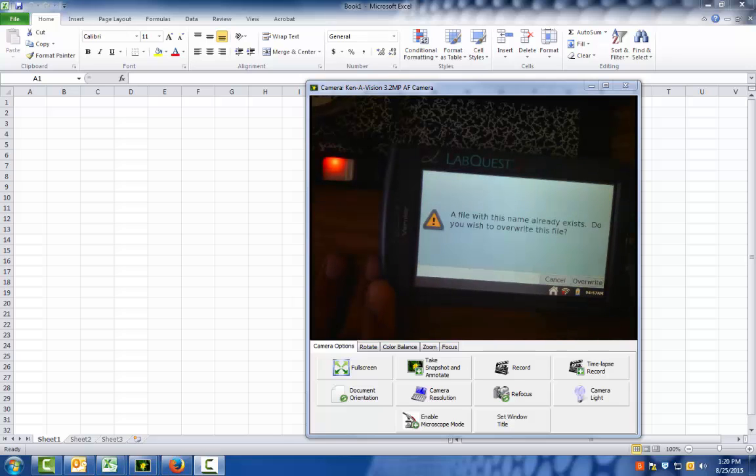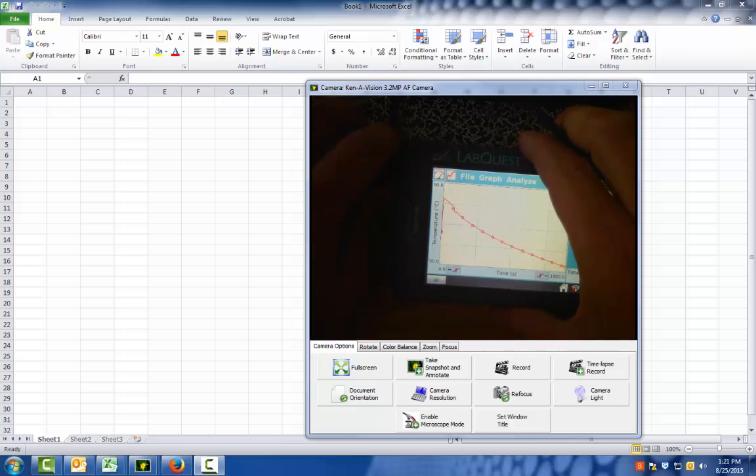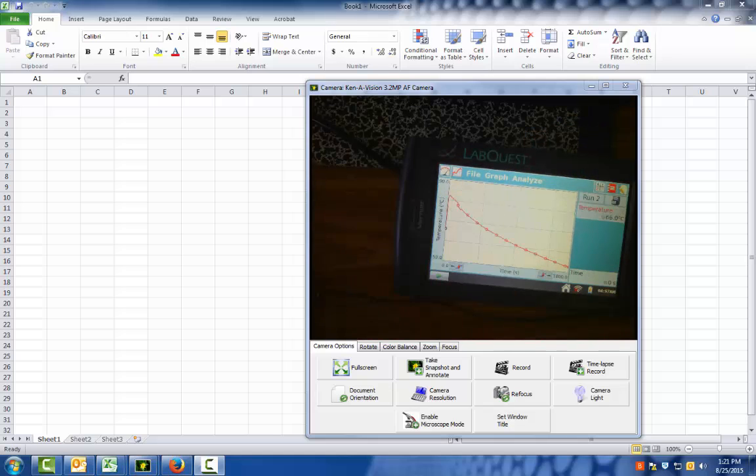Oh, we've already saved something like this. We'll overwrite it just for the experience. There it goes, and it saves it. Notice the USB is blinking. When it goes back to the breathing light, which is not the blinking, you'll know that it is done and complete. And there it goes. It's just uploaded it to the USB. At which point you can unplug this and plug it into your computer, and you'll be able to find the file that we just created.